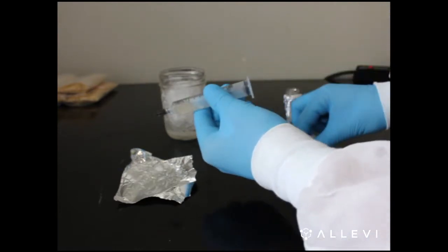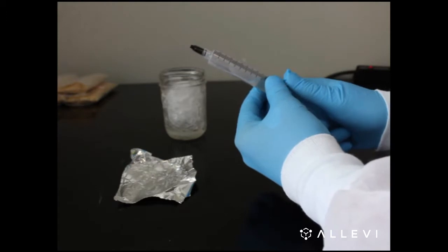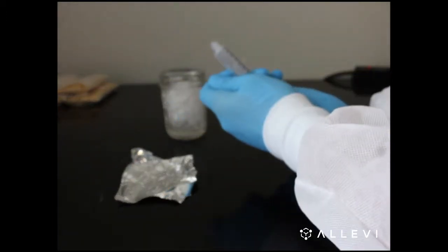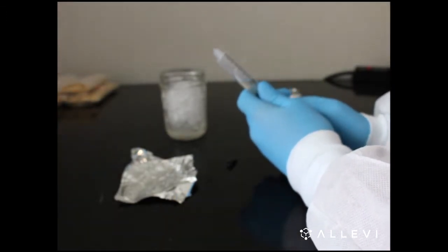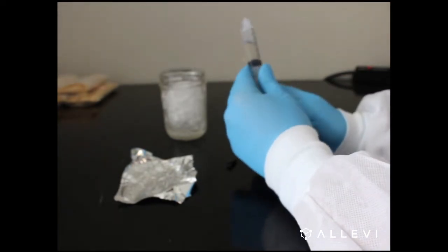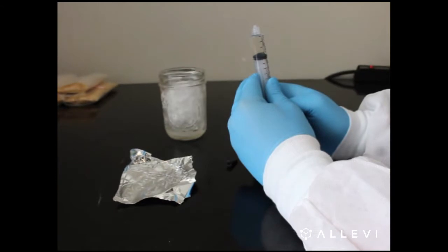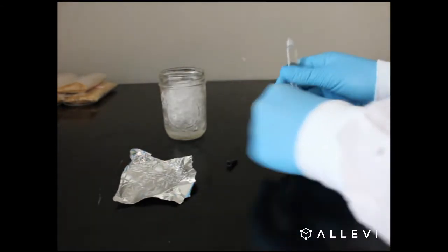Remove the black stopper from the plunger and insert it into the syringe. Using the plunger, push it back into the syringe. Release the cap to release the air pressure. Tap the syringe to remove air bubbles and recap it.